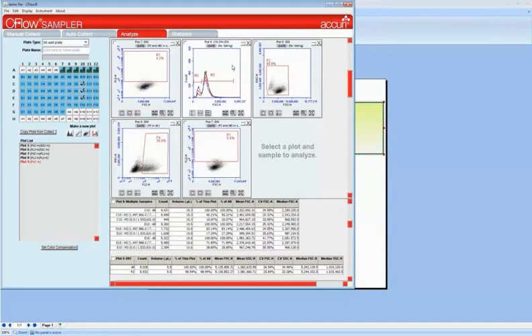So what we do with the CFlow importer in FCS Express is take that one single file, the C6 file that contains all of this information, all of the data, all of the plots and gates, and import that directly into FCS Express and turn that into an FCS Express analysis document, which is also called a layout file.